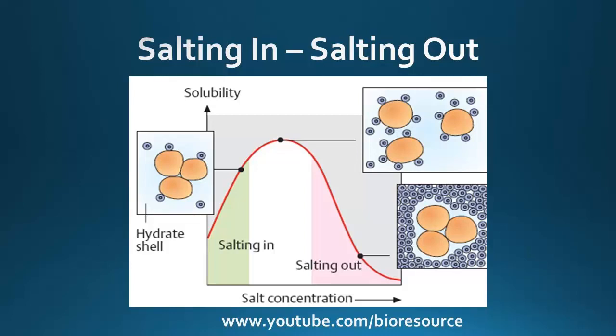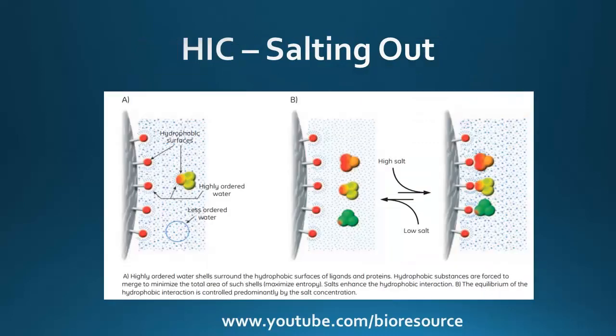Salts can also reduce the solubility of proteins by shielding charged groups which normally keep the protein apart in solution. When the electrostatic charge on protein molecules is shielded, these molecules can easily interact, form aggregates, and eventually precipitate. The solubility of different proteins is reduced to different extents by salt addition. So that is the role of salt in promoting the precipitation or the hydrophobic interaction with the matrix.